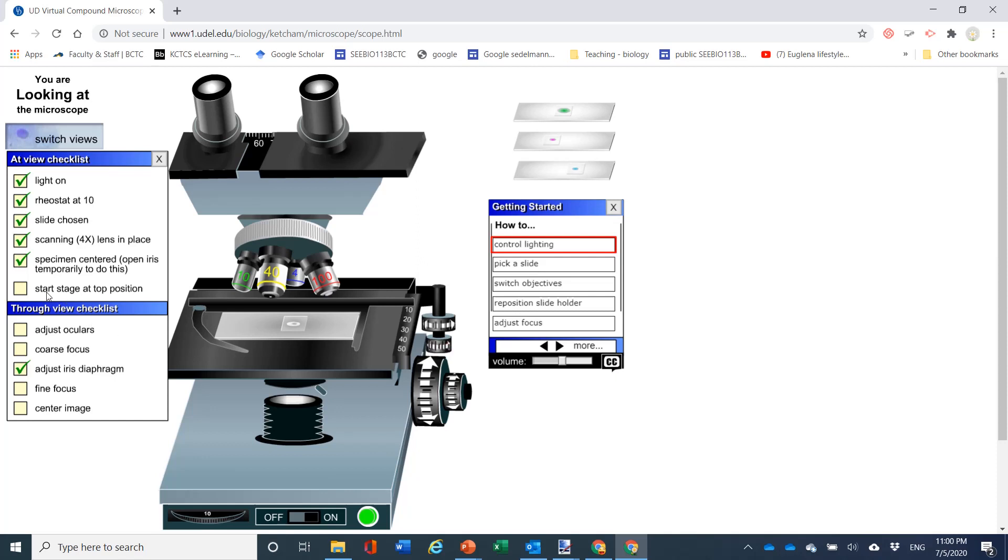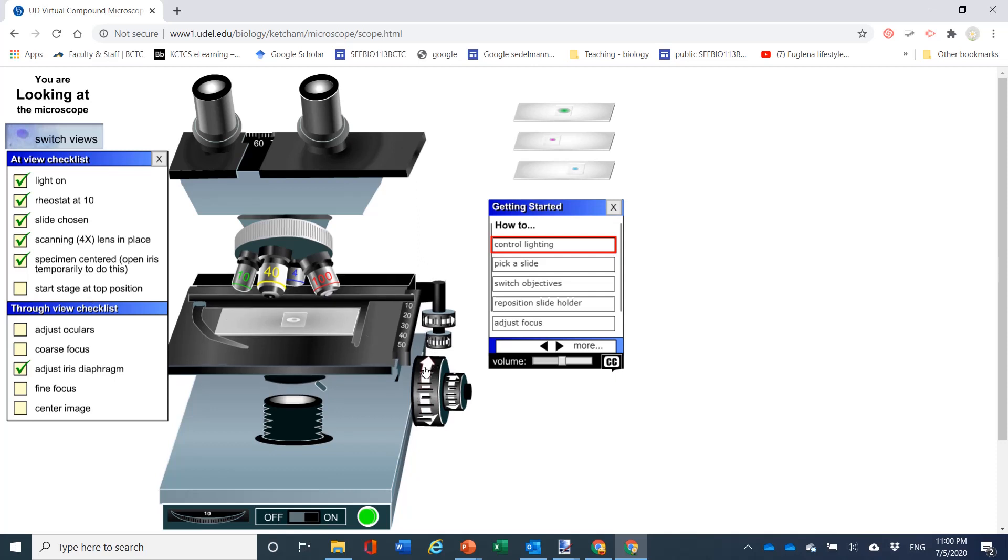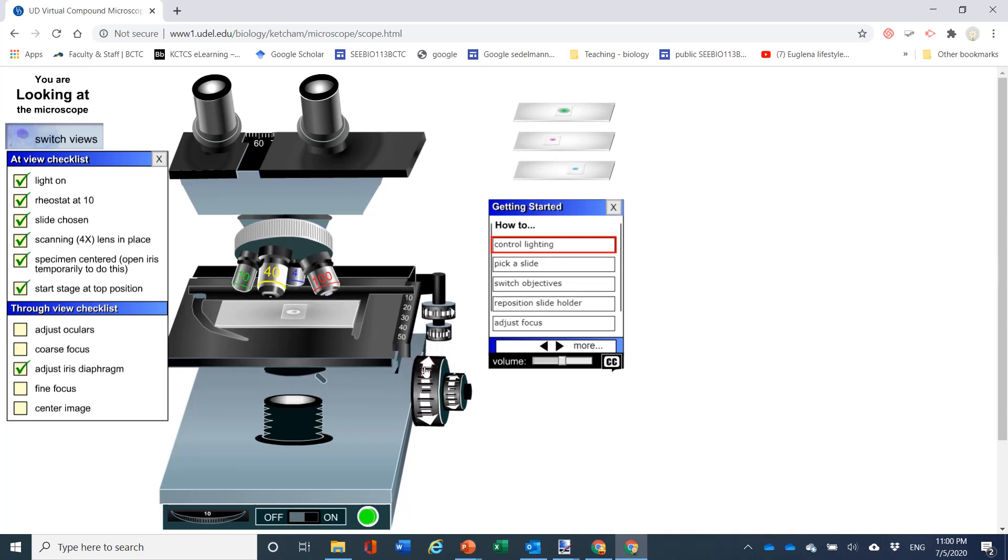Now this particular simulation wants you to start with the stage at the top position. And this makes sense because this way you're only going to move away from the slide. You're going to only move away from the objective, so you're less likely to slam the slide into the objective. At the 4X, there's no danger that you're going to slam the slide into the objective, so I usually start with it all the way down and then move up. But either way works with the 4X.